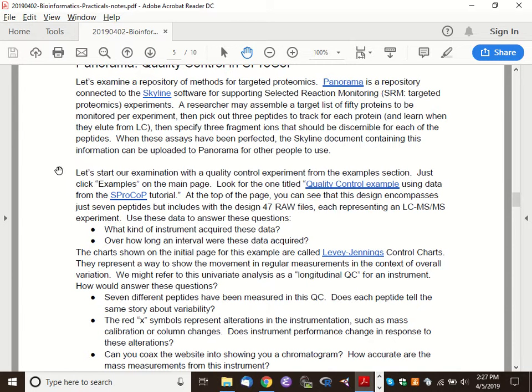You got 1,000 different proteins in this sample. There are far more peptides that could be observed than you will observe in any one experiment. And that means that shotgun proteomics is a sampling technology. Of all the possible peptides, you're just going to see a relatively small fraction of them. One of the benefits of going with a targeted proteomics experiment is that we can greatly reduce the degree of variability that we see from one run of the experiment to another.